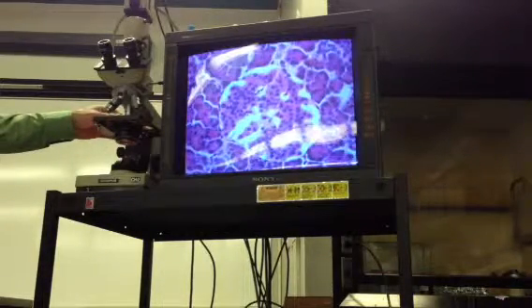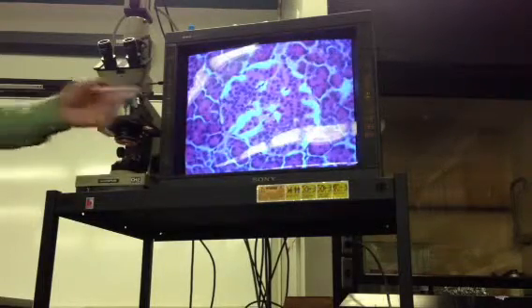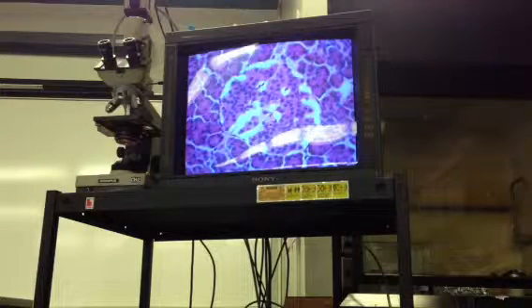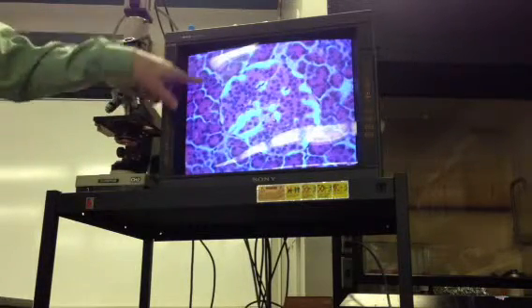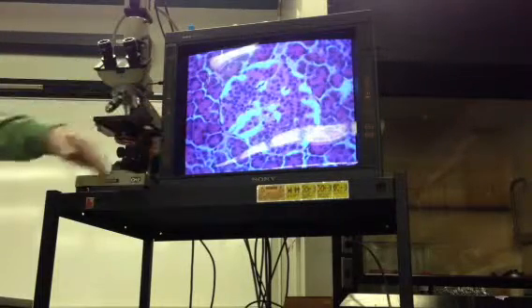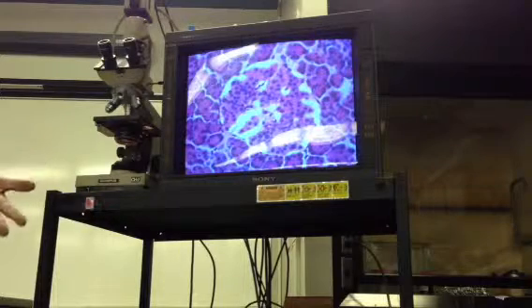Now as far as other cells making hormones, almost every cell in the body is going to be an endocrine cell for something, because cells communicate chemically, so it's not surprising that you find some hormones made by these cells, which are acinar cells, right? They make enzymes. So anyway, that's a really nice picture of an islet. Photo op here.